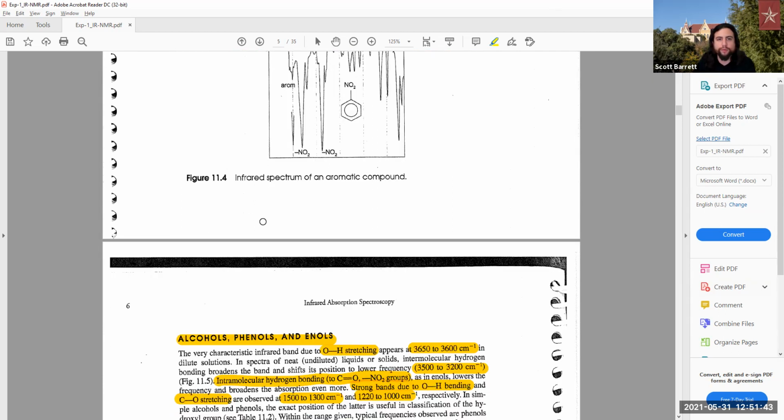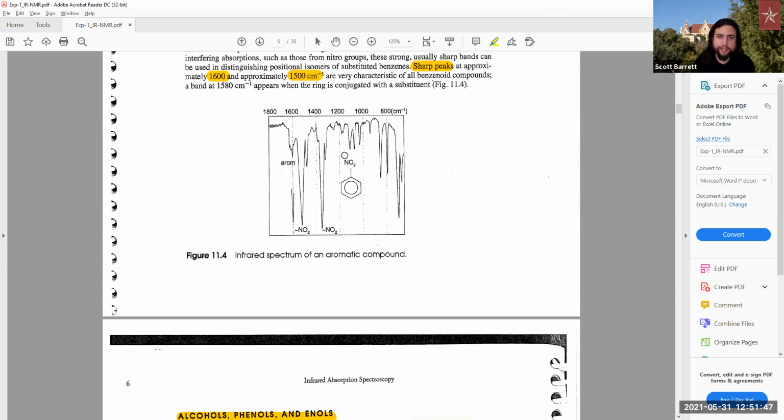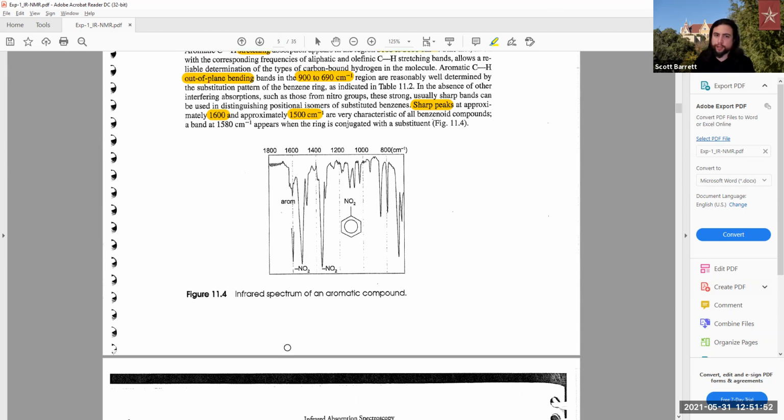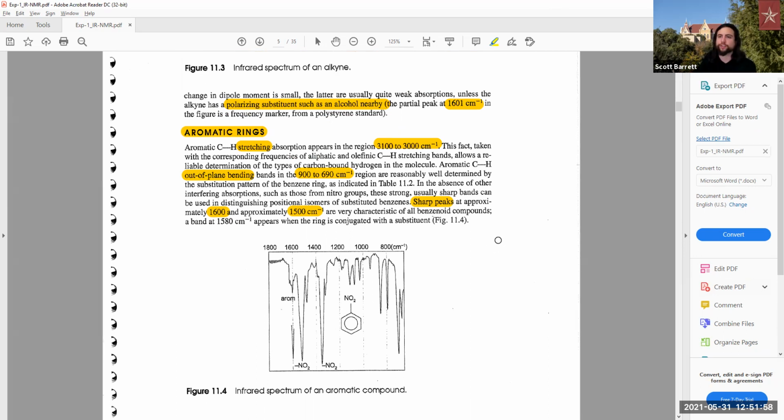And yeah, so here are some nitro groups as well, attached to our benzene ring in these areas. This is not a very good image. I would also recommend, if you have any significant difficulties understanding where any of these spectra are, as this is an older lab manual, to Google an IR spectrum of a specific functional group you're trying to find. And Google has a library.